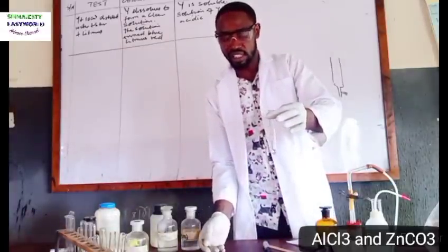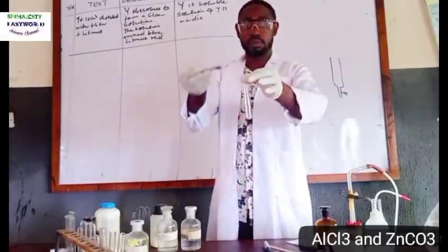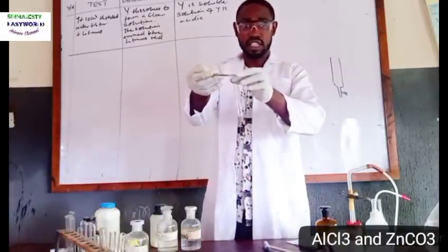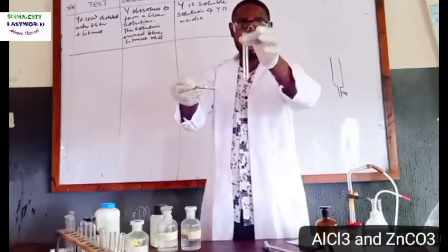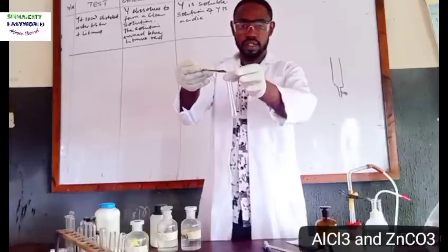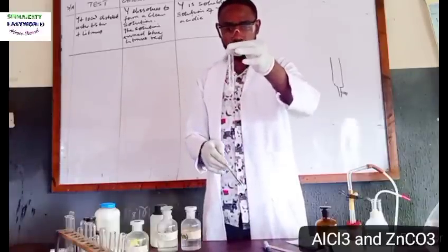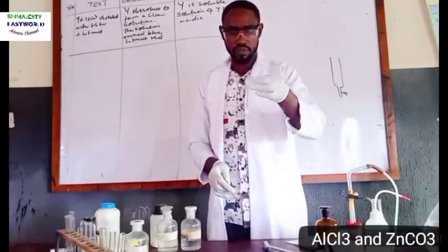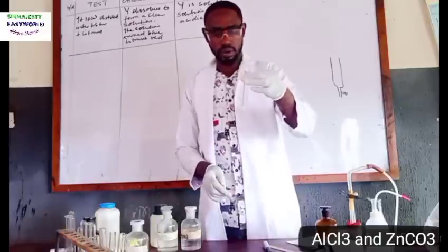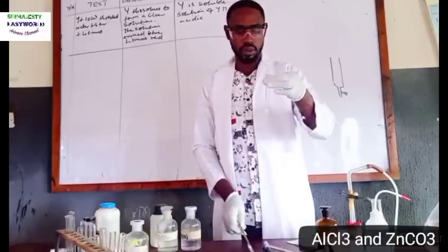So in this analysis, you might be told to use HCl to do the same, or use the same aluminum chloride to do the same. So I'm adding the zinc carbonate into the first portion of the solution of aluminum chloride. So definitely there is effervescence, though it's not showing clearly there in the camera. There is effervescence, a kind of colorless gas coming out.